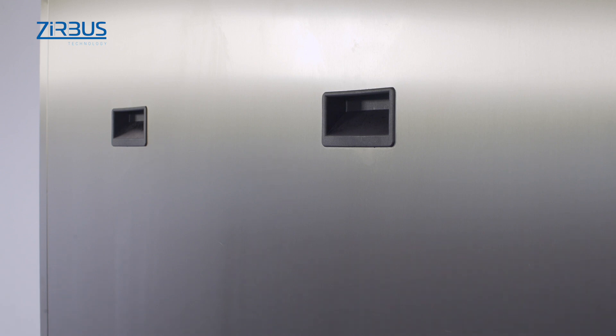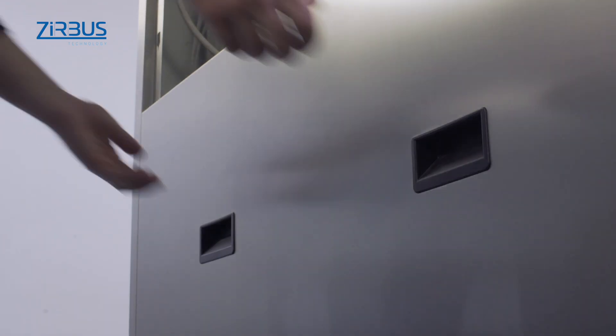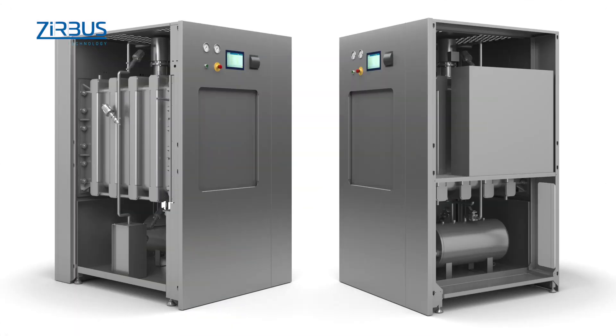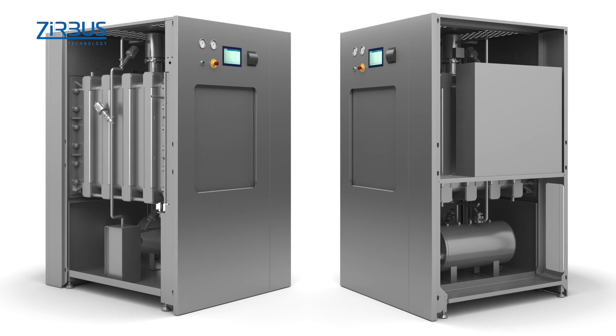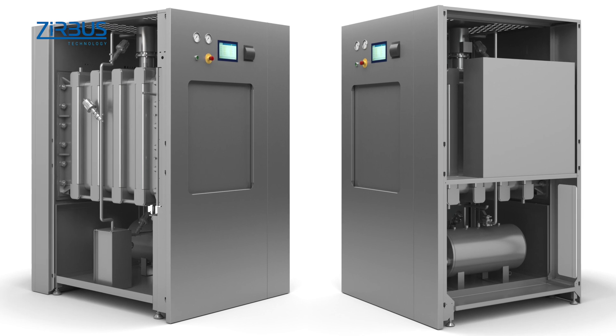The sterilizer was developed with an eye to more than just function. Considerable attention was also paid to cost-effective maintenance and cleaning. Maintenance is quick, thanks to its easy-to-remove metal housing. The recessed handles in the housing make the unit easy to disassemble, while rounded corners and edges make the inside of the autoclave easier to clean.